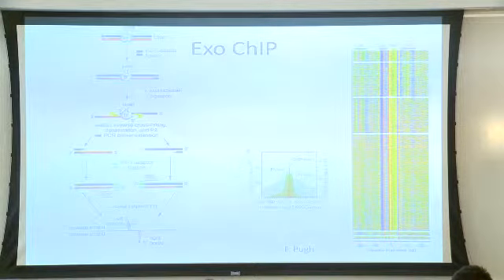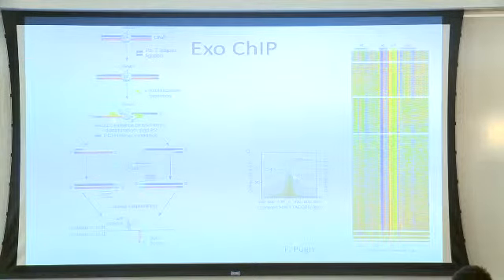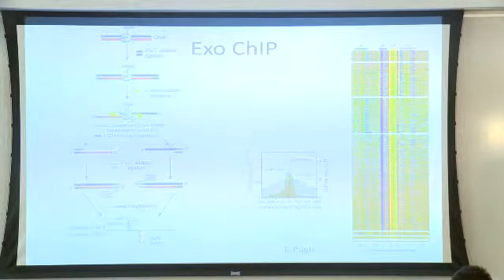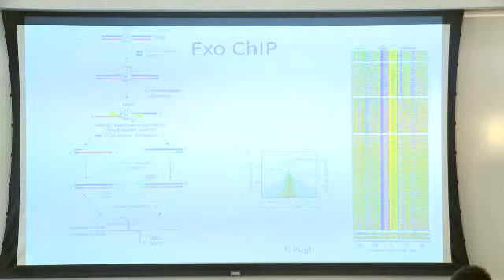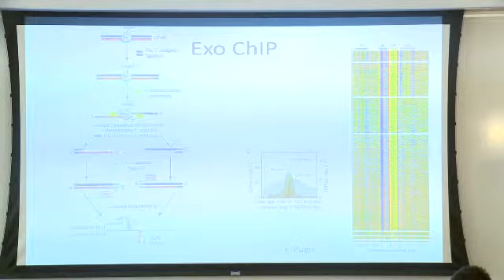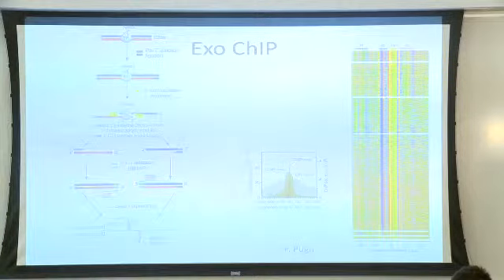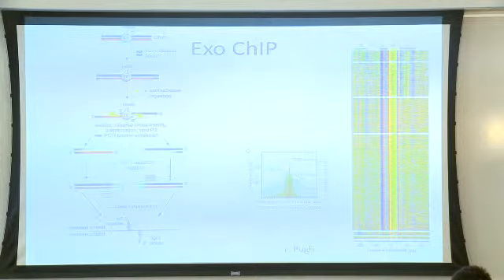Okay, and by so doing, you recover the information about where the actual 5' end of these sequences is. So that when you then do a PCR primer extension, the end that you reach is the end that was left by the lambda exonuclease digestion. Okay, and that's followed by a more conventional adapter ligation and next-gen sequencing.